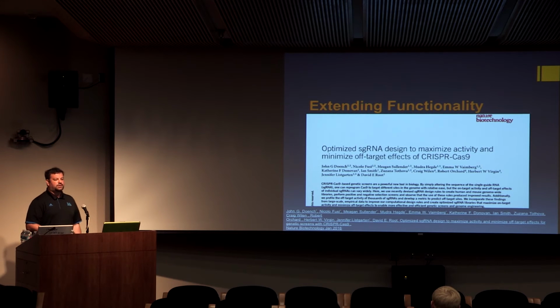So this is around the time that I actually met a team from Microsoft Research. They were working on applying machine learning to predicting CRISPR target site efficiency, so on-target efficiency. And we decided we'd work together because essentially they're building the ranking scheme that I would eventually need.